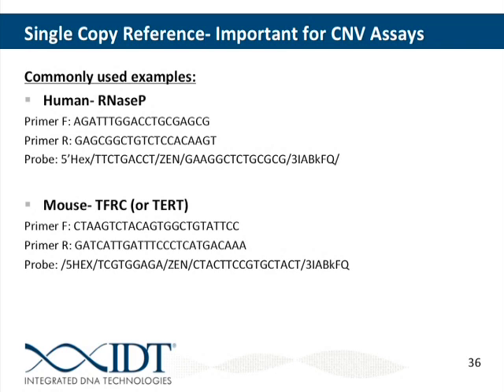And so that is the end of our design consideration training. Does anybody have any questions about any of these designs or designing in general? On the CNV, what would the end results look like for a copy number, say 100 versus 50 copies? Would that be a lower Ct after you do the analysis from the single copy? Right, you're going to see a shift in your Ct.